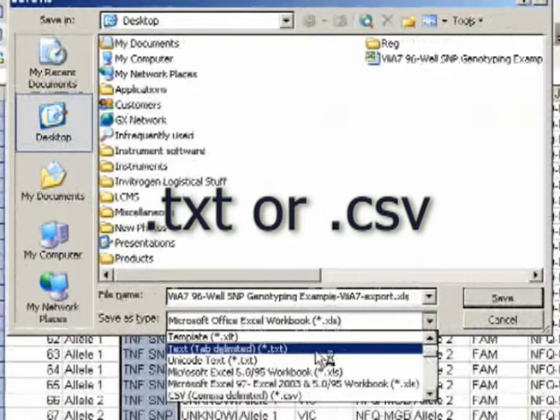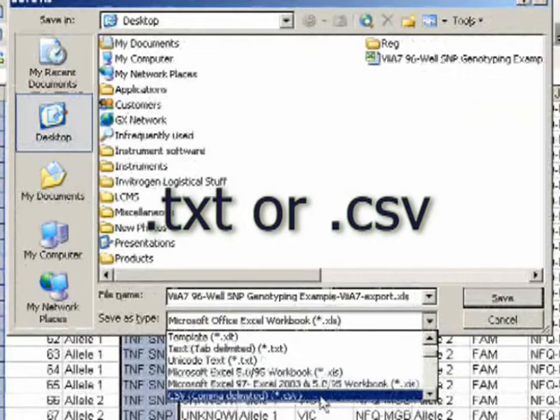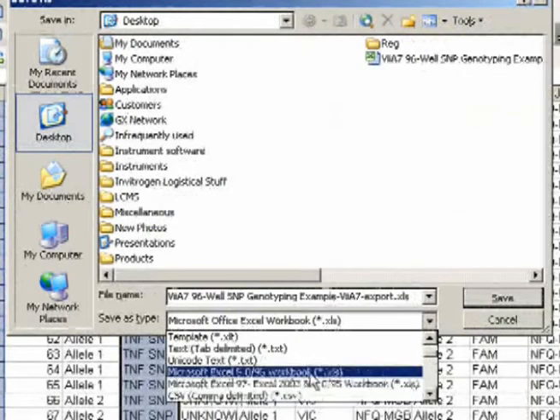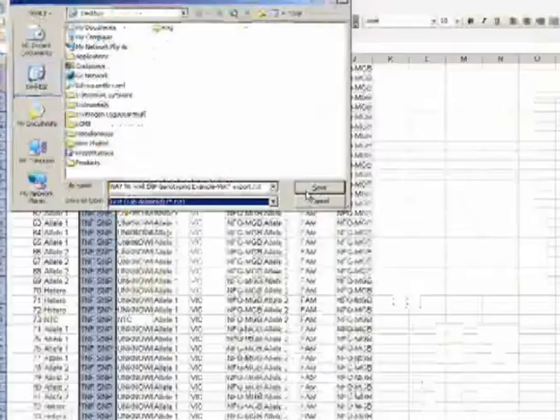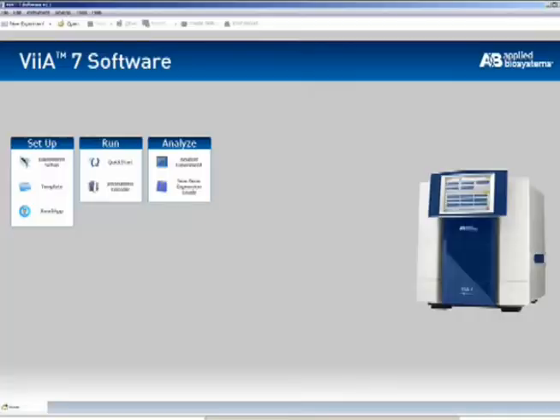I need to change the file type to either .txt or .csv, since again, these file formats are compatible with importing. Okay, done.